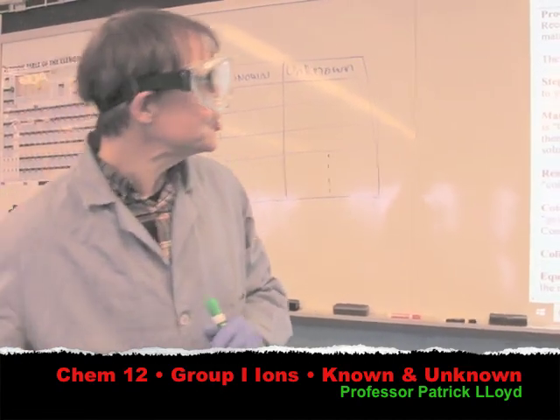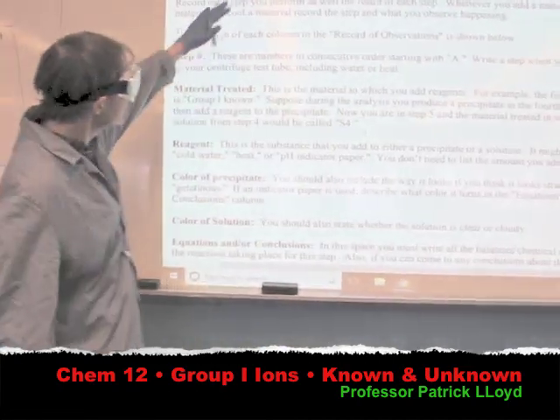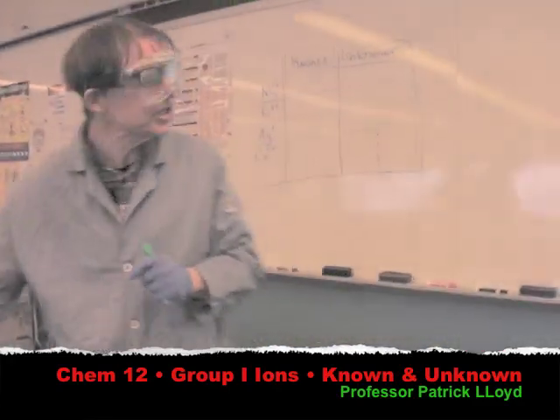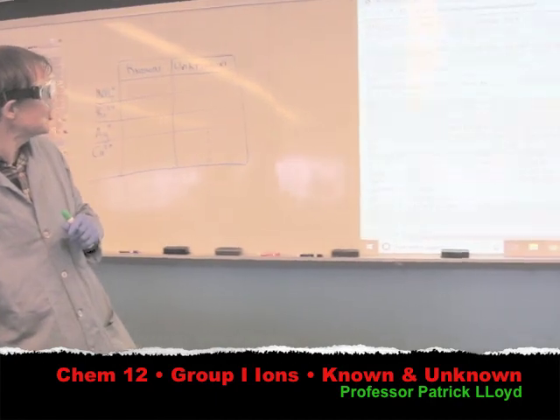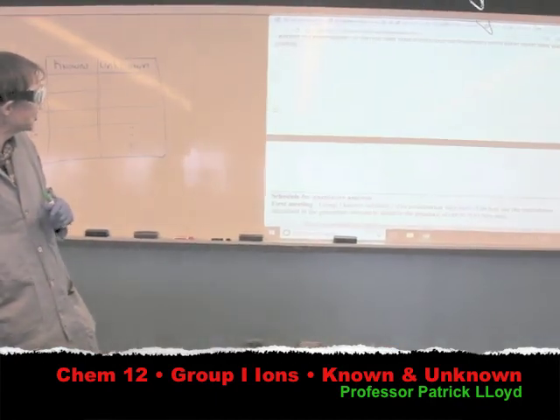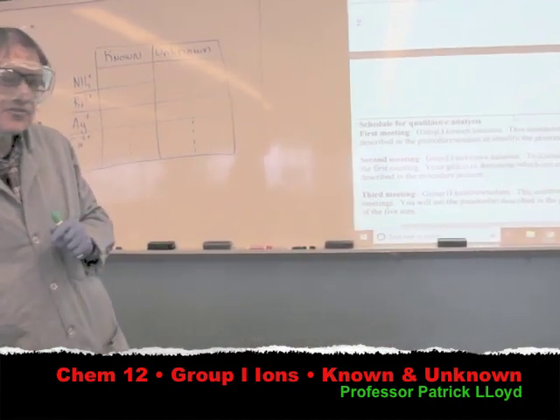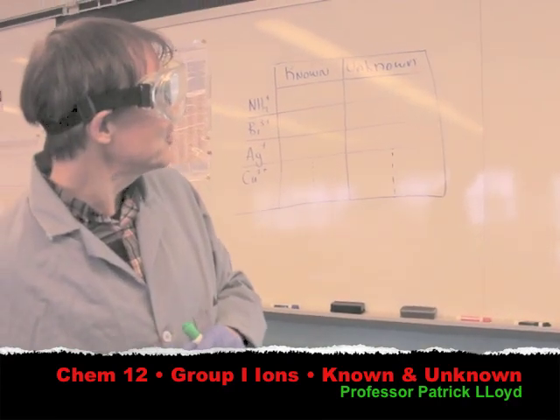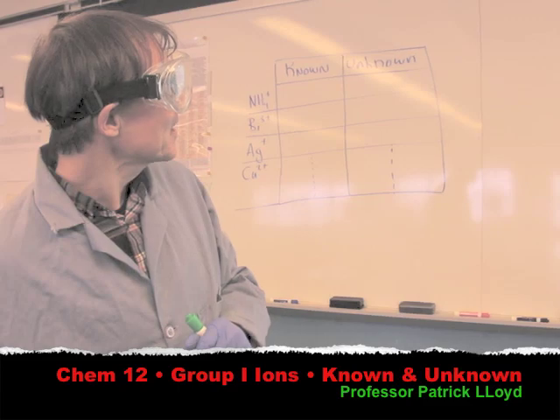Now as you read through the procedure, there are some details in terms of how you might write down the information as you go along, and some details about the materials that we're using. In this video lecture, you will see how it's done by me as your demonstrator.